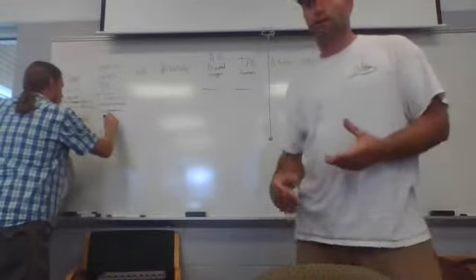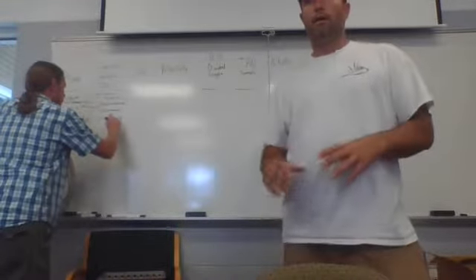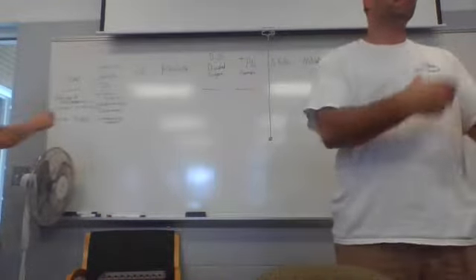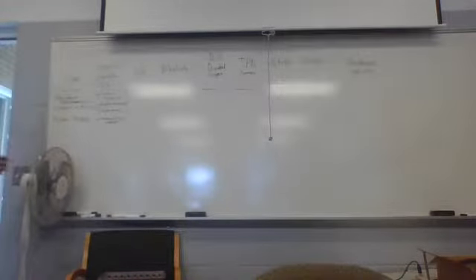The electrical conductance meter. There are several different types of them. Most meters that are going to tell you salinity are really measuring conductivity and then doing some calculations in there. I found some really old school conductivity meters that we had around here.